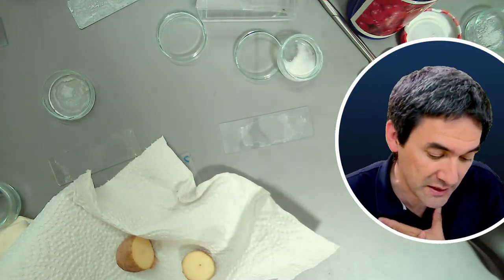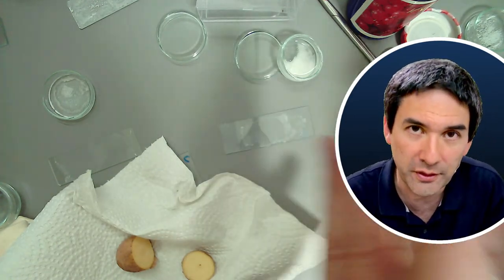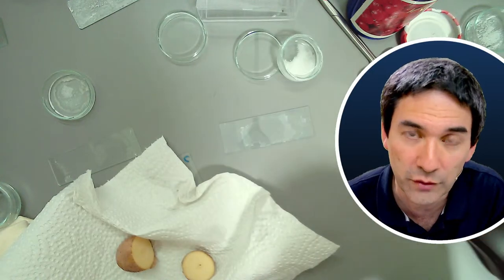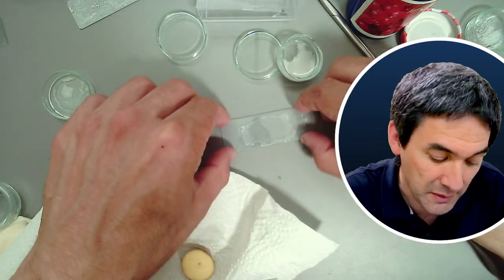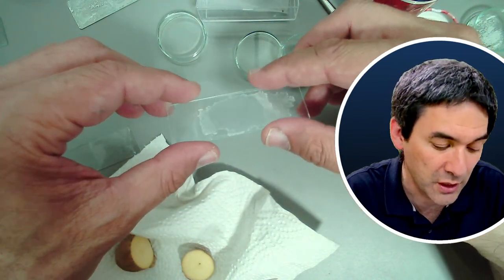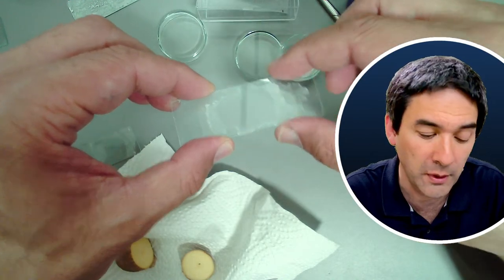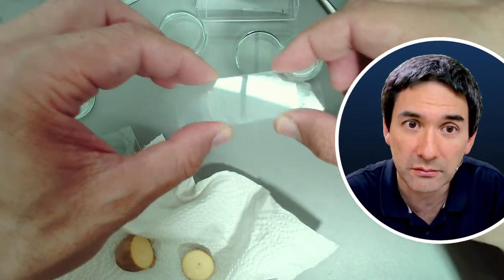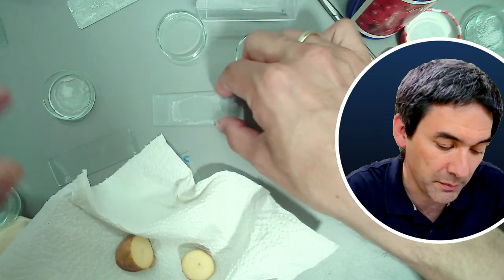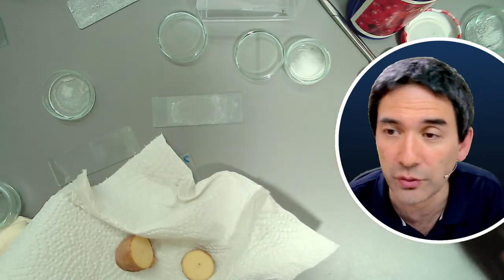So what I would suggest is either use a mounting medium which does not dissolve the crystals, and there is no standard solution for this, it simply depends on the crystal, or as a general purpose solution you just make a dry mount where you just use some tape and glue a cover glass on top for protecting the crystal. So that's simply something I recommend. I've done this already before, and I've kept some of the crystals quite some time.